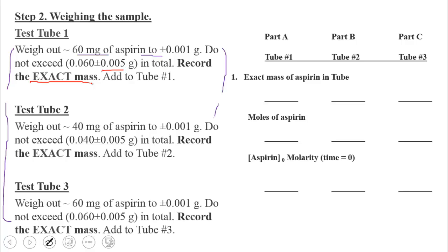Now, what you will want to do is make a data table in your lab where you will be measuring your exact masses. So for example, I as a student measured out exactly this many grams. And of course, in your lab, include units. Up here, this is how many grams we have, but here this will have units of moles, and this will have units of molarity. So make sure you're putting units on your numbers, because I will check your carbons for that, and of course your end results when you hand in your data.